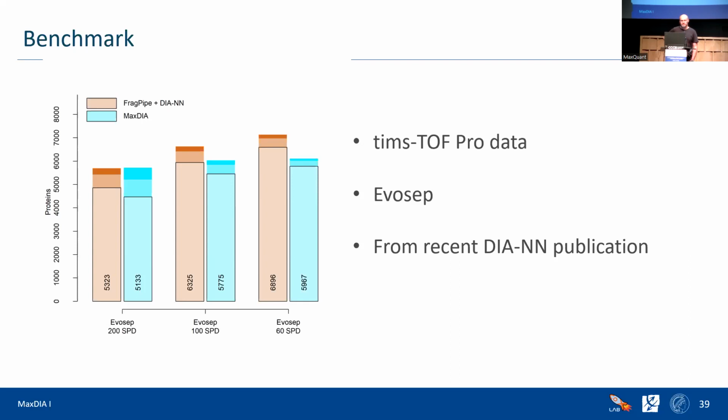Okay, last question. Yeah, one more. This is just to learn. When you are talking about identification, you show, for example, precursors, fragments and protein groups to compare which method is better. Have you looked at the proteins, so average proteins? What happens if using different algorithms to do DIA, you detect a lot of proteins, but not many protein groups? Which method would be better?